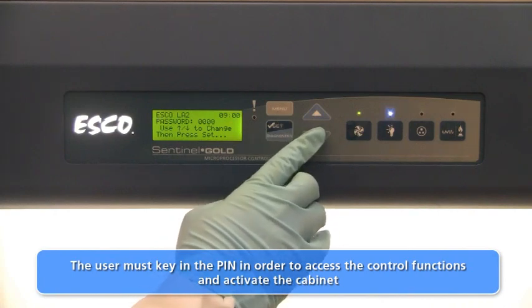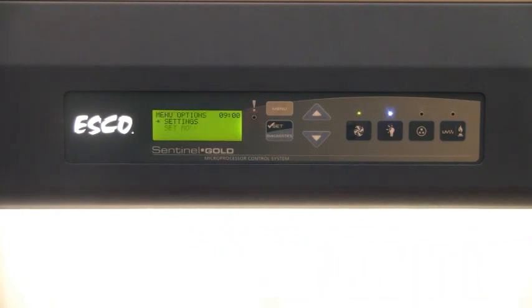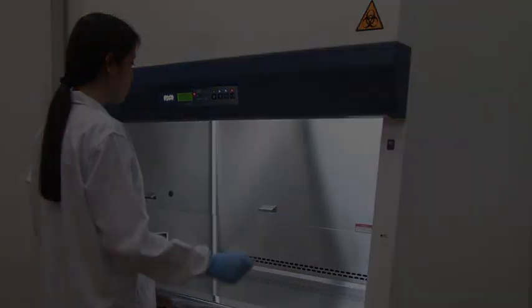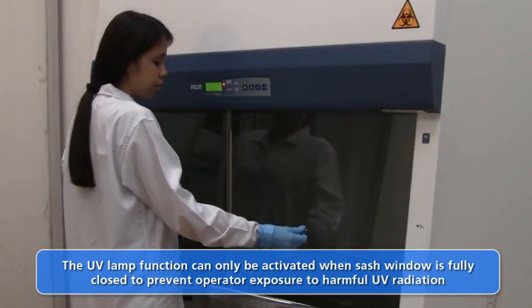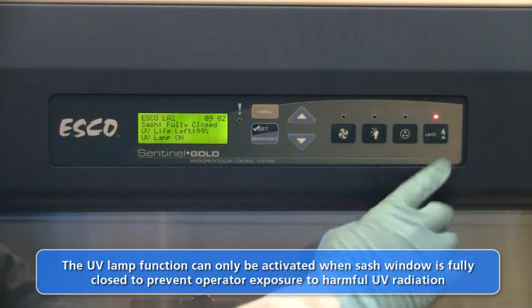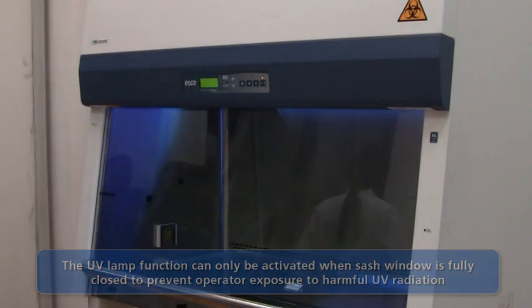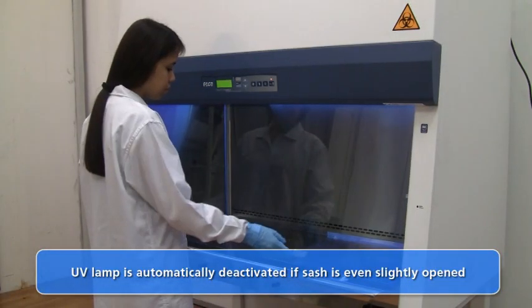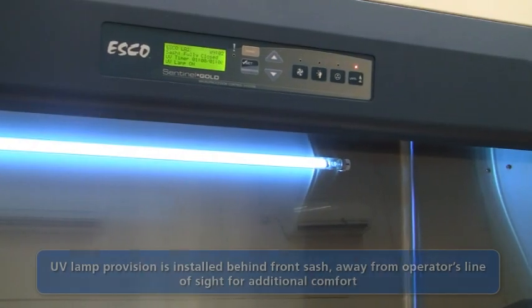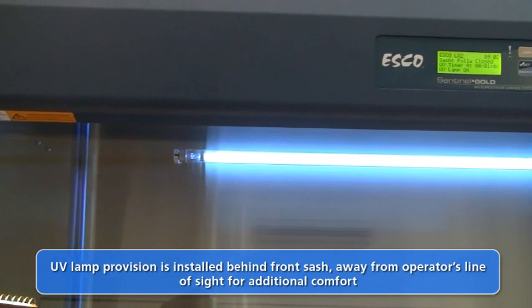The laboratory supervisor may use this feature to restrict cabinet access by unauthorized personnel. However, the use of quick start mode will disable the fan PIN functionality. The ultraviolet germicidal lamp on the cabinet control system is interlocked with the sash window position for additional safety. This means that the UV lamp may not be activated unless the front protective sliding sash is fully closed. The UV lamp is automatically deactivated once the sash is even slightly moved from its fully closed position. The UV lamp is installed out of the operator's line of sight, ensuring protection from direct UV radiation.